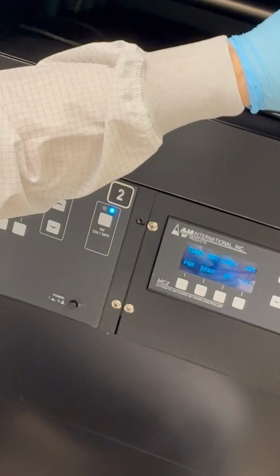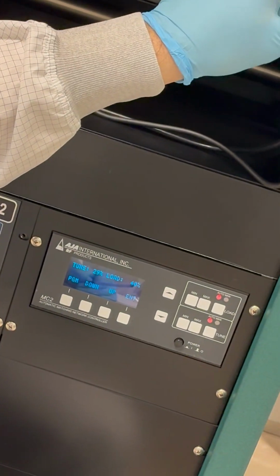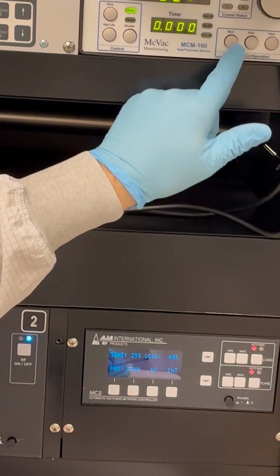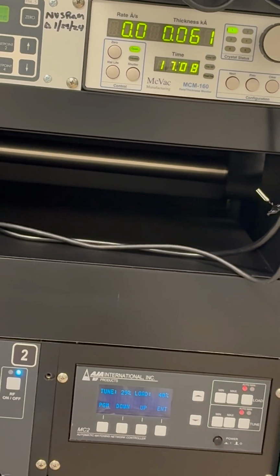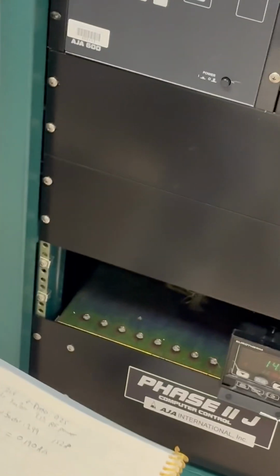When you go and program, you can just drop that tooling factor down to 100, and it's going to tell you a number that is the actual growth rate. I had to divide by that tooling factor to get the correct actual growth rate.